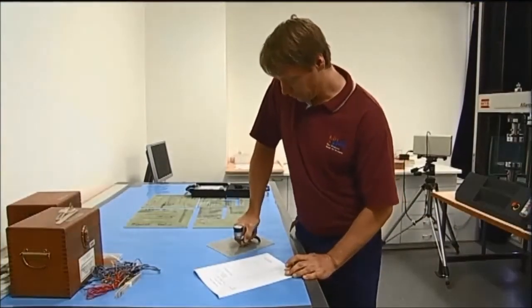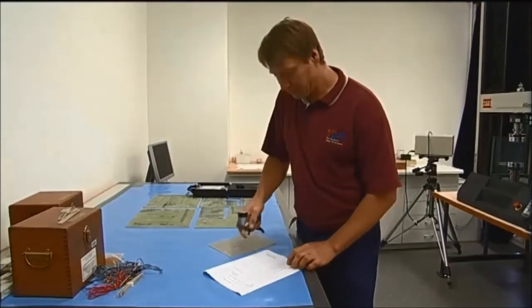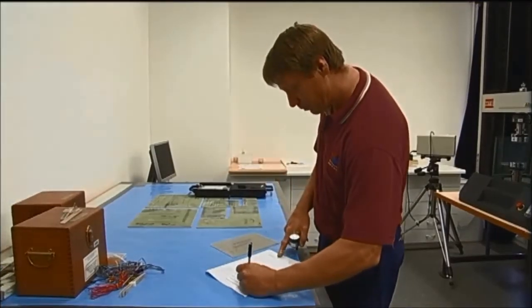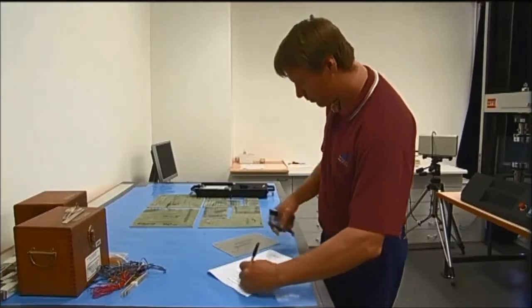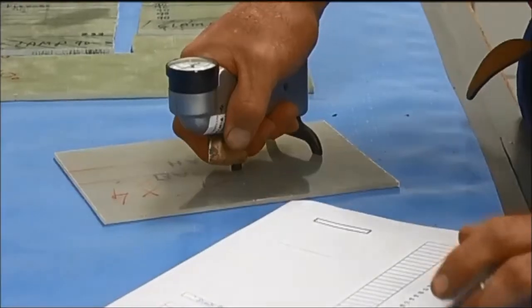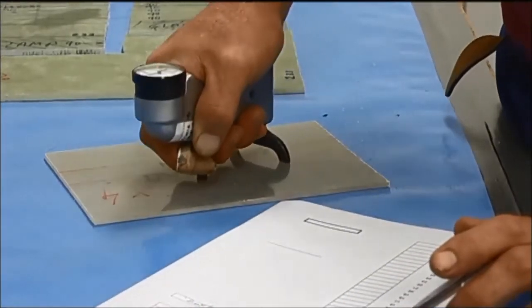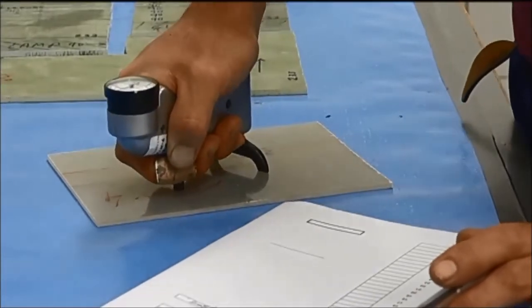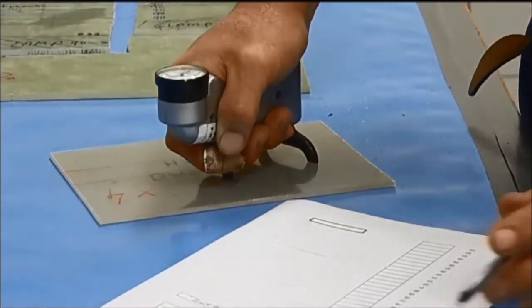The Barcol hardness test is used to determine the hardness of both reinforced and non-reinforced rigid plastics. This test characterizes the indentation hardness of materials through the depth of penetration of an indenter loaded on a material sample.